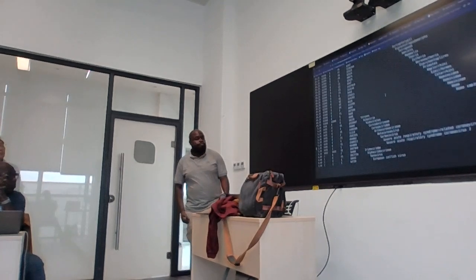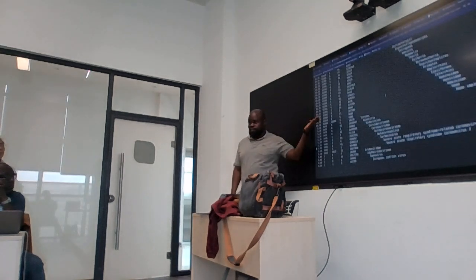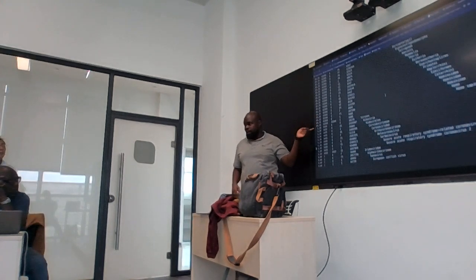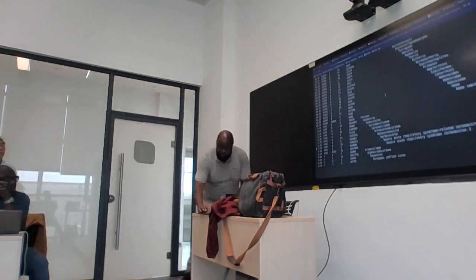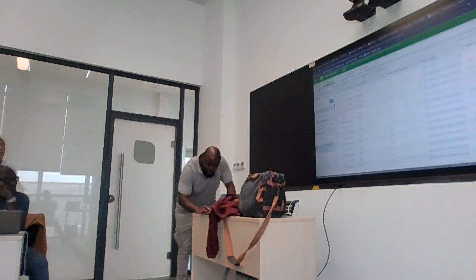So we always expect that we are going to have some human sequence, right? That happens. But we don't expect it to be this high, okay? Because if I went back here, this particular sample, let me see.